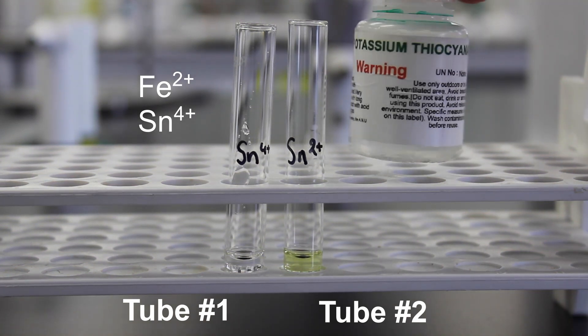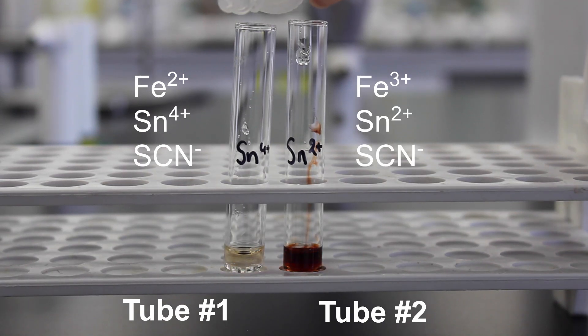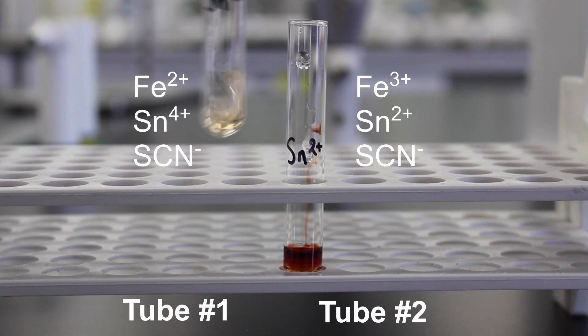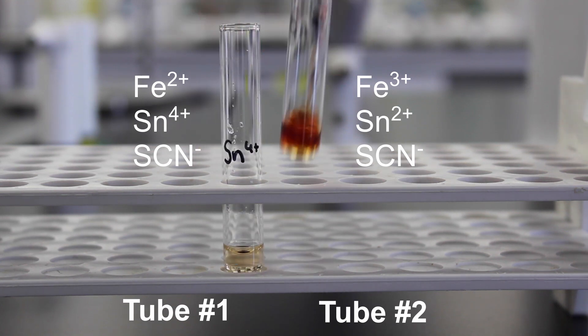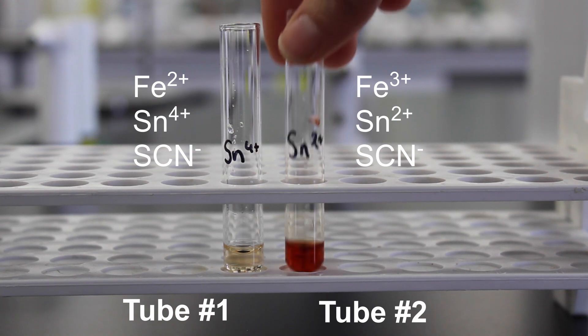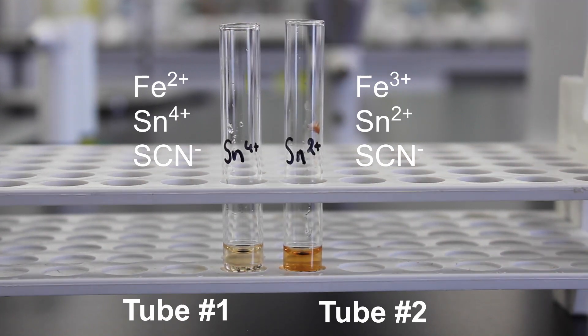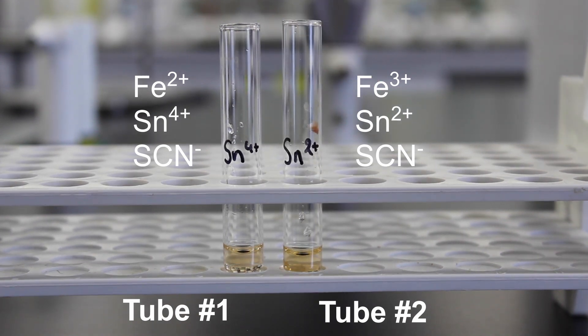We will again be using thiocyanate ions as an indicator for these reactions. Make sure your tin is added in excess. This is so we can ensure all iron 3+ ions that might be reacting with the tin get reduced. After a minute or so, it should be evident whether a reaction has taken place.